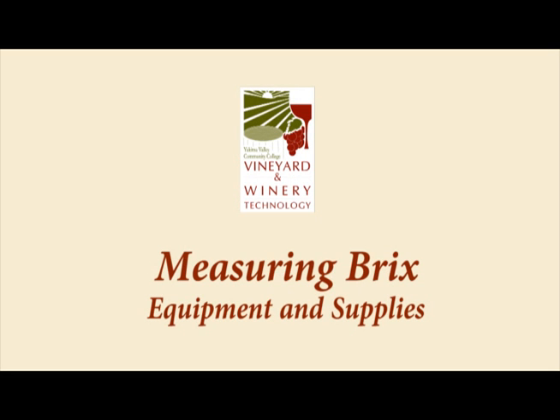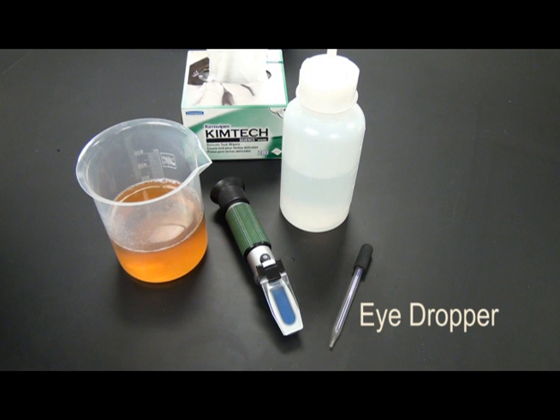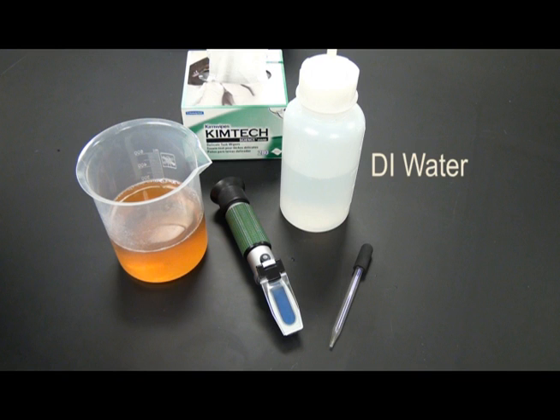The equipment needed to test Brix in juice with a refractometer includes a refractometer, eyedropper, juice sample, a DI water bottle, and Kimwipes.